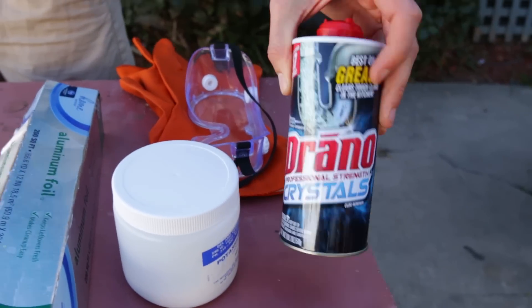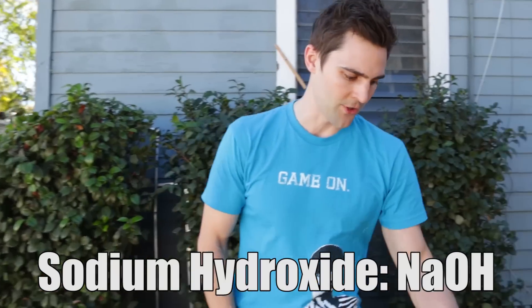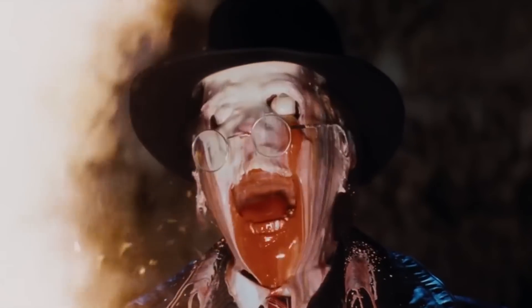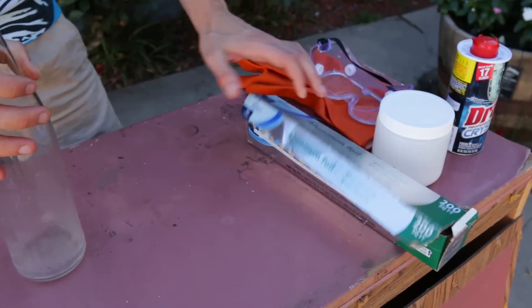We're going to use drain cleaner — the key ingredient we want is sodium hydroxide. We have a more pure form here. It's very caustic, it's gonna melt your face off. So we're going to mix some of that with water and put it in this container along with aluminum foil.